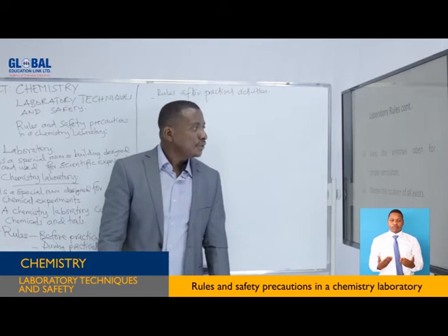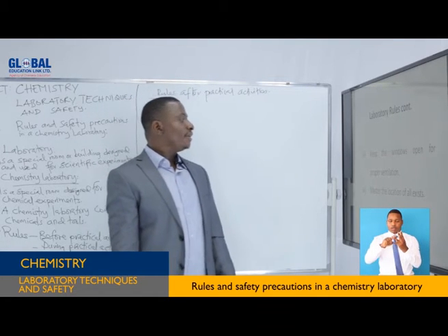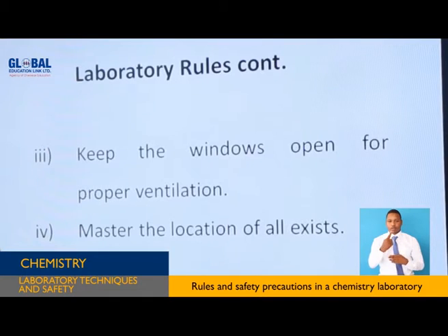Let's see rule number 3. Rule number 3 says keep the windows open for proper ventilation. Laboratories always have large windows. Therefore, when you go to the laboratory, open the windows for proper ventilation.